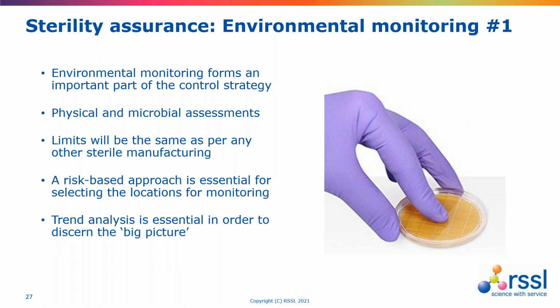And the standard array of methods should be used, so surface, air and personnel monitoring, using a risk-based approach for selecting environmental monitoring locations.